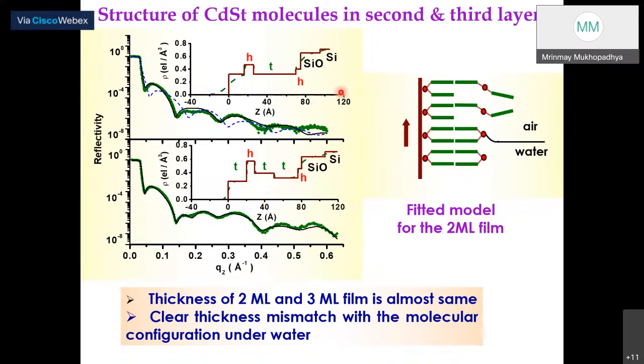You can see that, sorry, both are triple layer, 3-layer deposition. And here, what we have done, I told you about isotopic substitution in my last class, that you can actually change H by D. H means hydrogen, by deuterium.